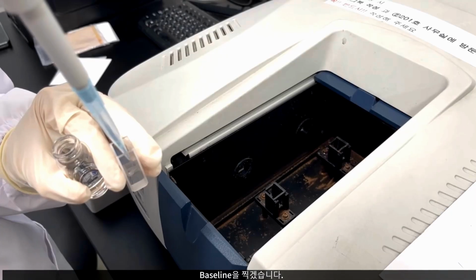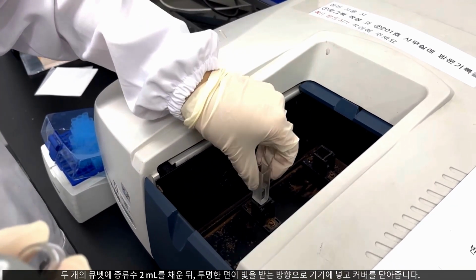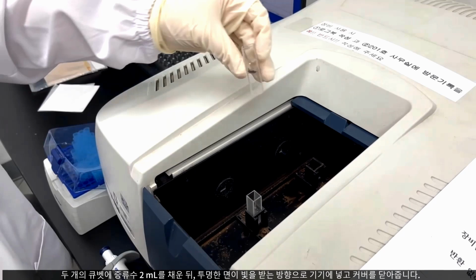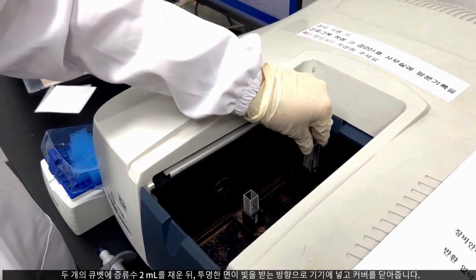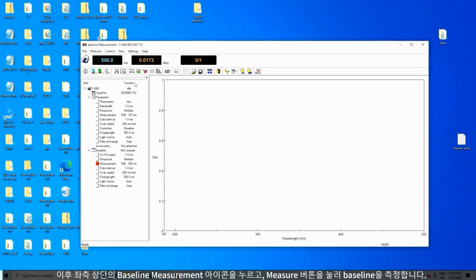Now, we will perform the baseline measurement. First, 2 cuvettes are filled with 2 milliliters of distilled water. They are then placed into the instrument with the transparent sides facing the light path, and the cover is closed. Next, the baseline measurement icon at the upper left corner is selected, and the measure button is pressed to record the baseline.